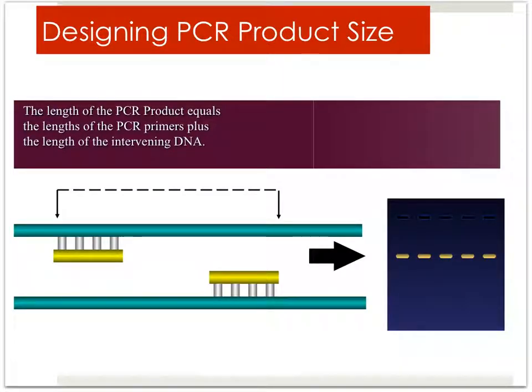How do you design, and how do you know your PCR product size? That's an essential thing, especially with the traditional, classical PCRs that we all still use, and will use in the future as well. It is your product size, or amplicon. The amplicon size is important, right?